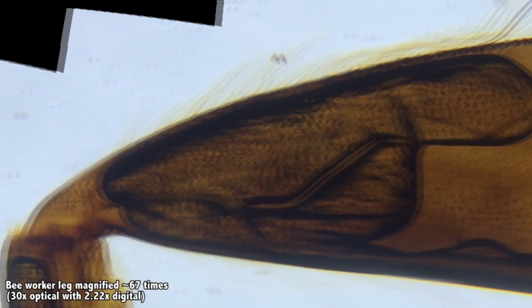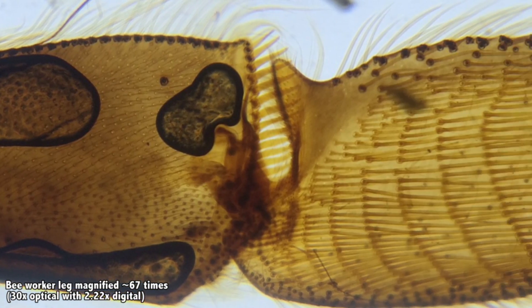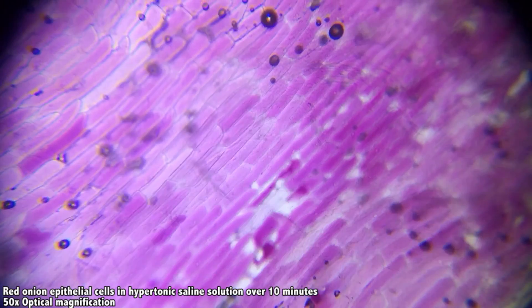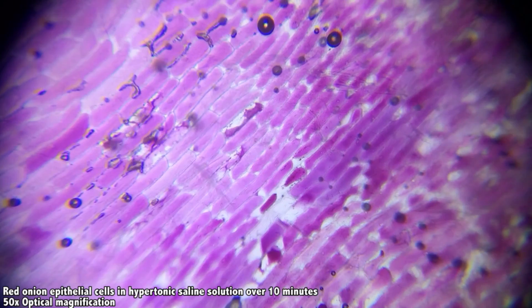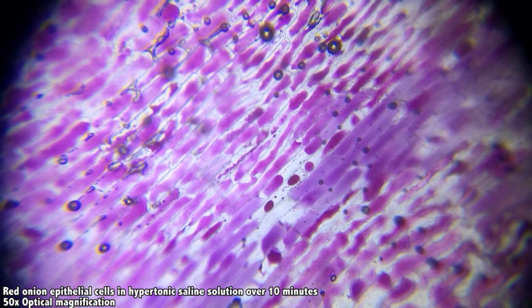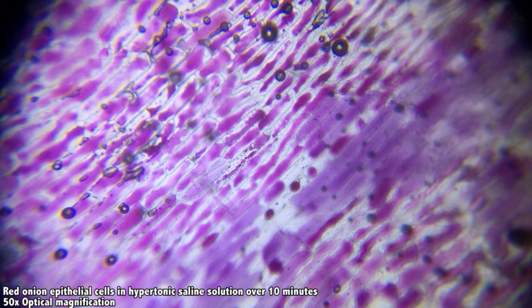And as simple as all these features are, this is actually a huge innovation. There's no other microscope that does this that isn't several times larger, heavier, or more expensive. This is the problem that I want to tackle, and I think having a scientific tool that's this versatile and accessible is going to make a huge difference to a lot of people.